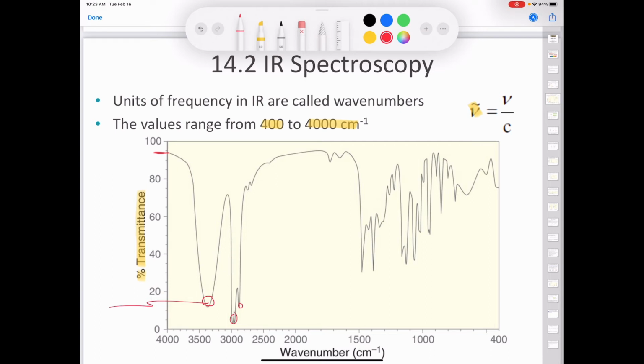All of the spectra in our course will be reported in units of wave number rather than wavelength to be consistent with what's commonly done by scientists today. Don't confuse the terms wave number and wavelength.